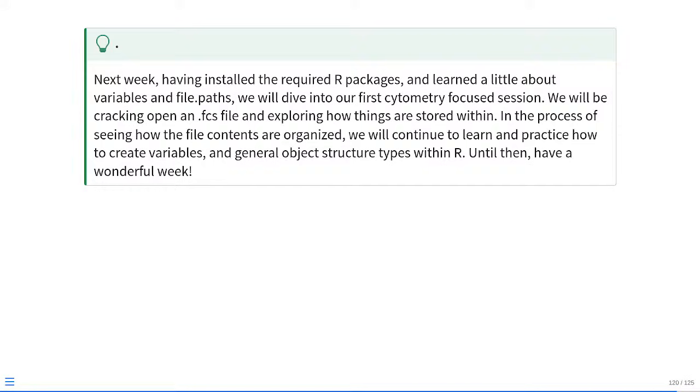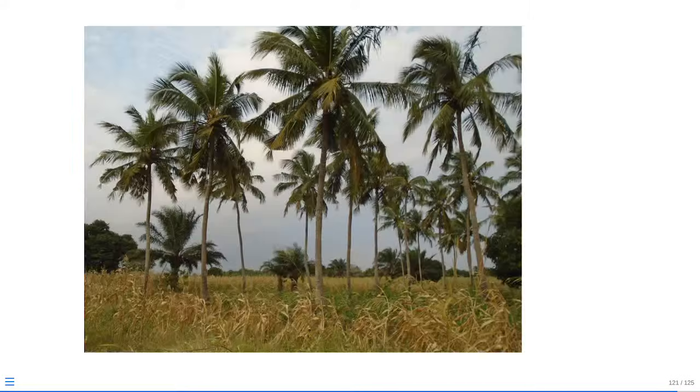We'll be taking a dive at that, but then we'll also be building on some of the concepts we've worked on today in terms of basic R knowledge and building them into more structured objects like matrices and data frames, just so we have a little bit of a building block of what's going on.